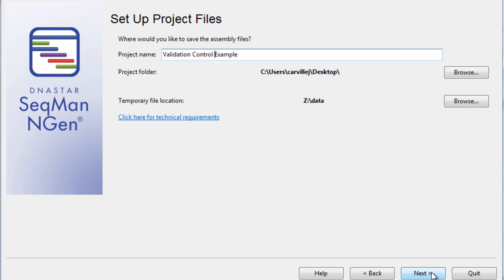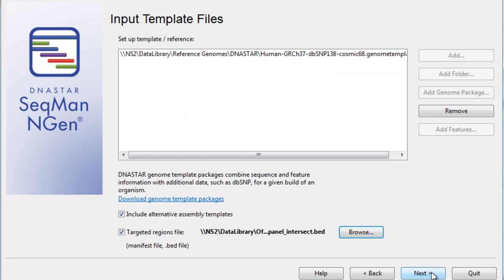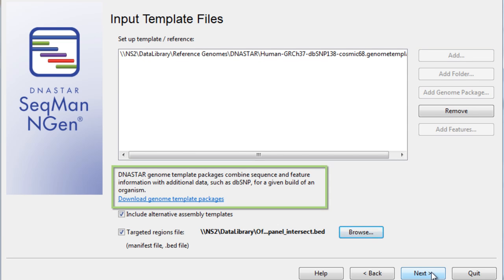Next, we'll choose to name our project and designate our file save locations. In this screen, we'll import our reference file. Here, I'm going to use a Human Genome Template Package, which you can download from the Dnastar website.